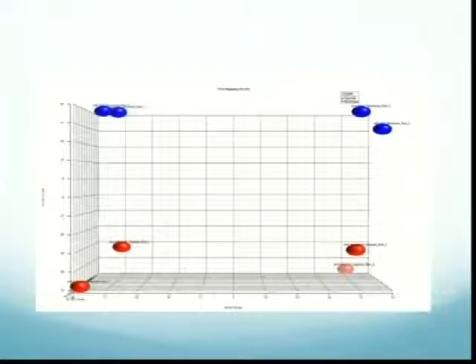Interesting. That's close. Interestingly, the number one source of variation isn't this major change in oxygen condition, it's that these samples were sequenced in May and these were sequenced in December.